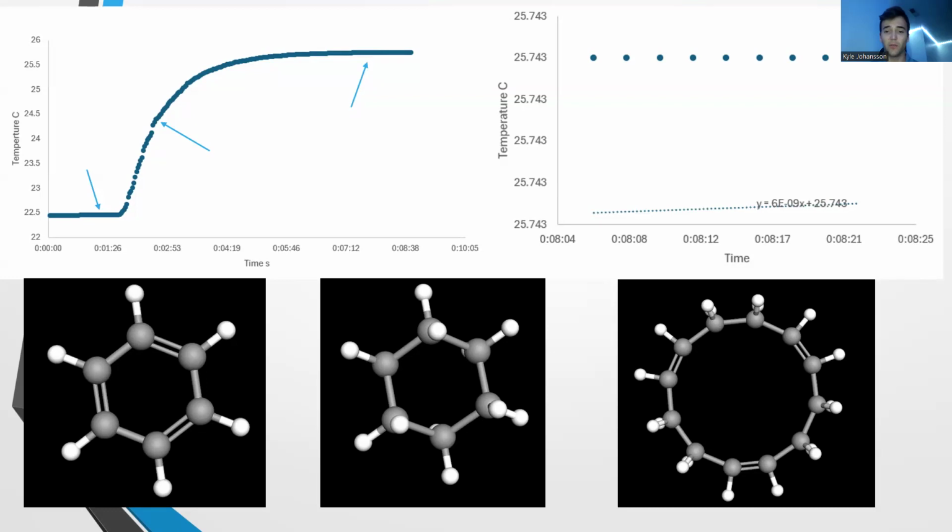From this graph, points that are used to find the change of temperature can be determined and then used in the future equation. Also in this equation, the slope of certain parts of the shown graph are used for that same equation. The areas of interest were focused on, and their own graphs were created to determine their slope values for further calculation, which can be seen in the graph on the right.